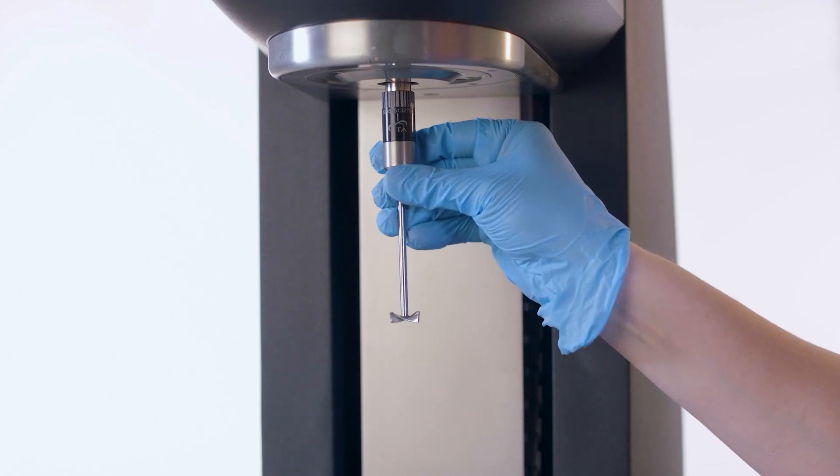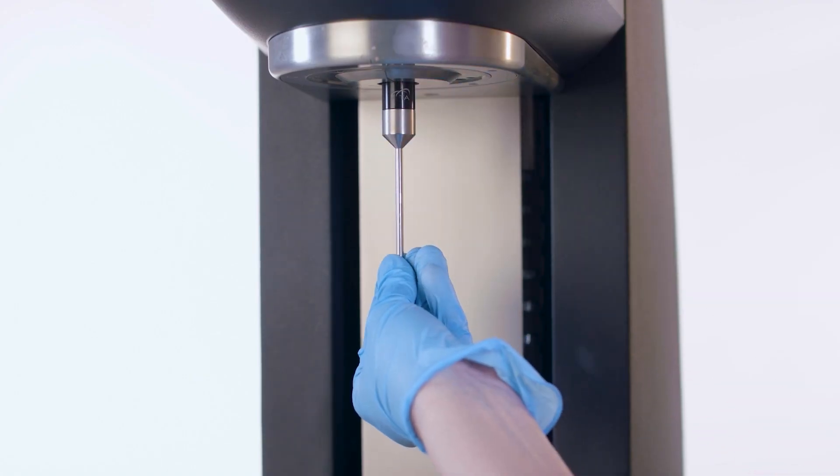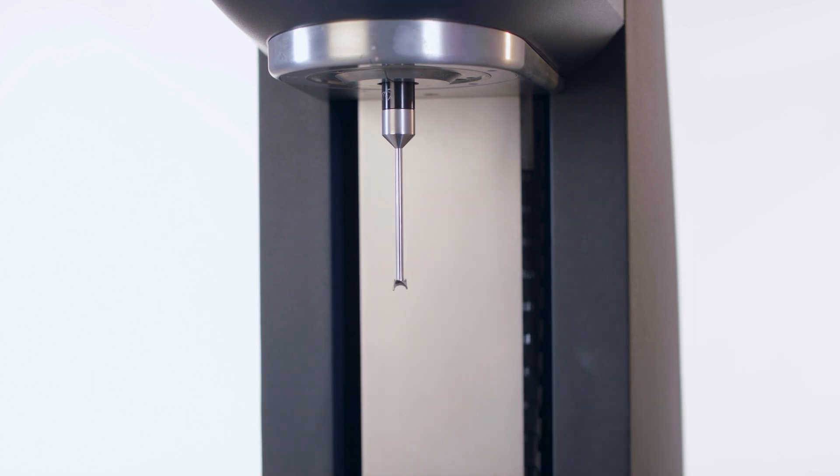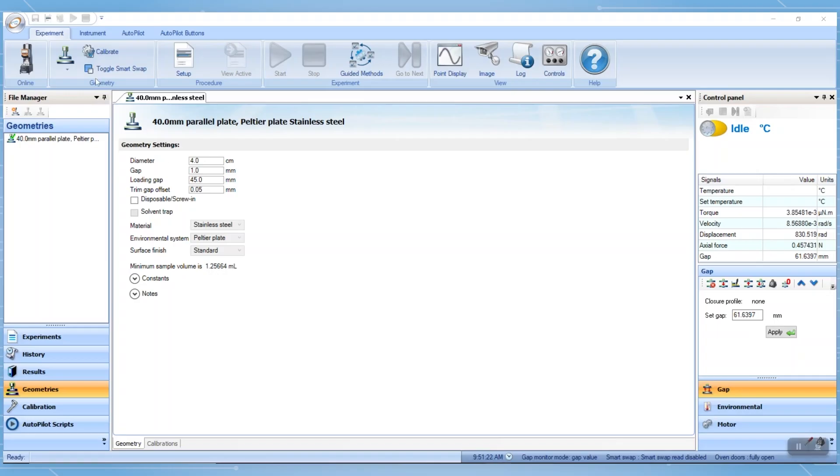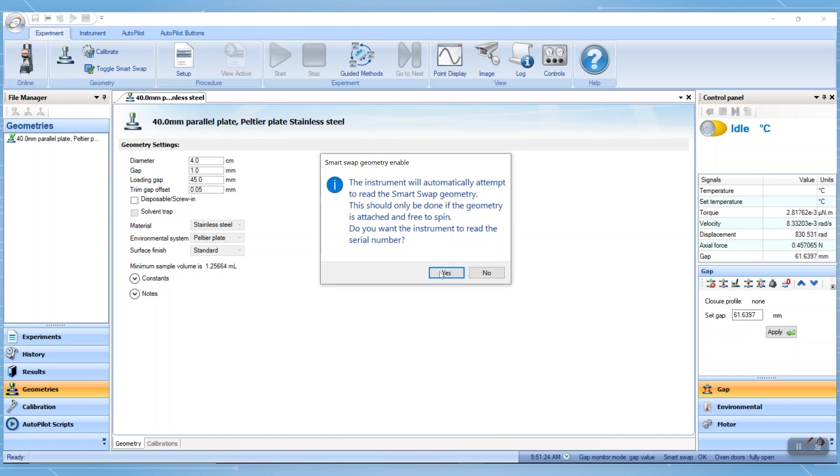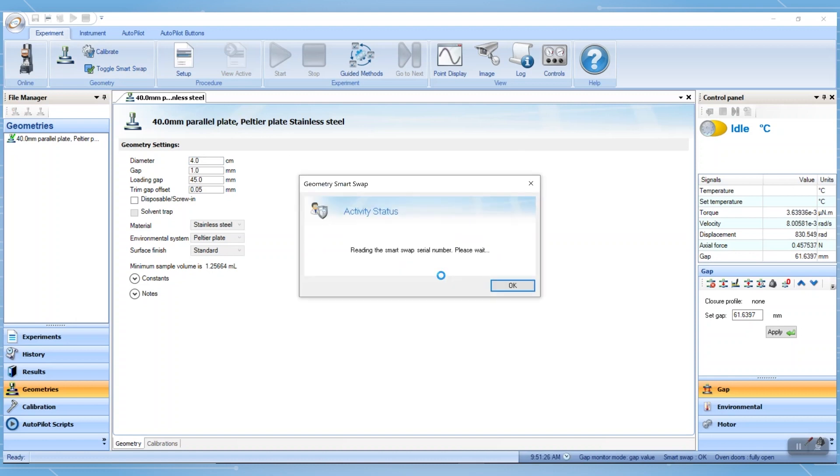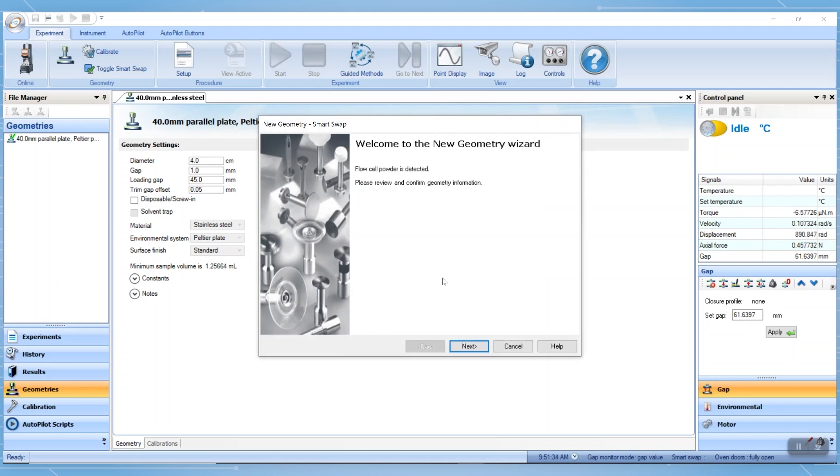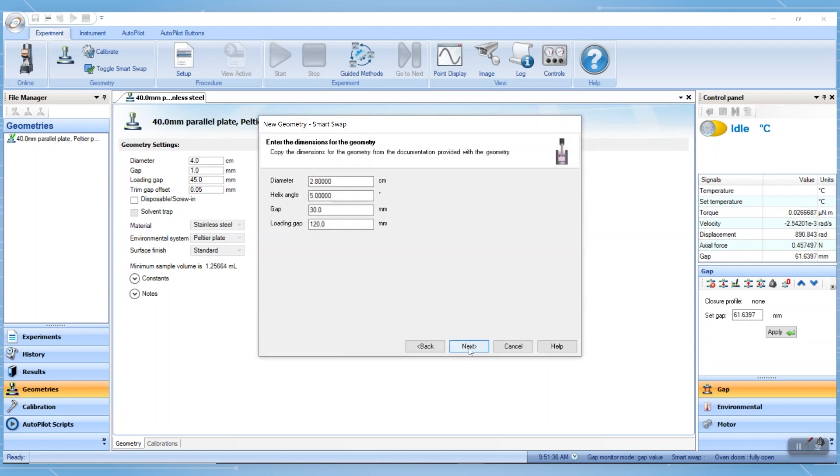The geometry is loaded by pushing it up the spindle and screwing the draw rod finger tight. With smart swap enabled and showing a green check mark, the geometry label is red and the new geometry wizard starts automatically. Review the parameters and click next and finally click finish.